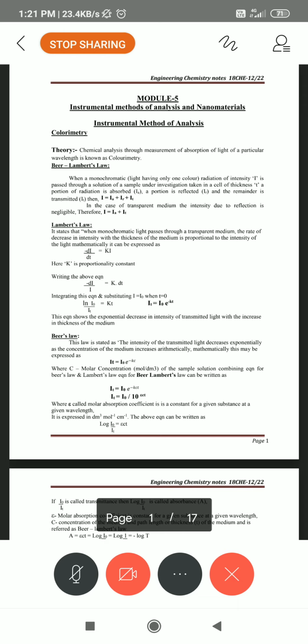The third 34, the fourth 32, the fifth 30 ml. Afterwards, take one more 50 ml volumetric flask. To that, take 10 ml of water sample, add 10 ml of Spadns reagent and 1 drop of sodium arsenite.